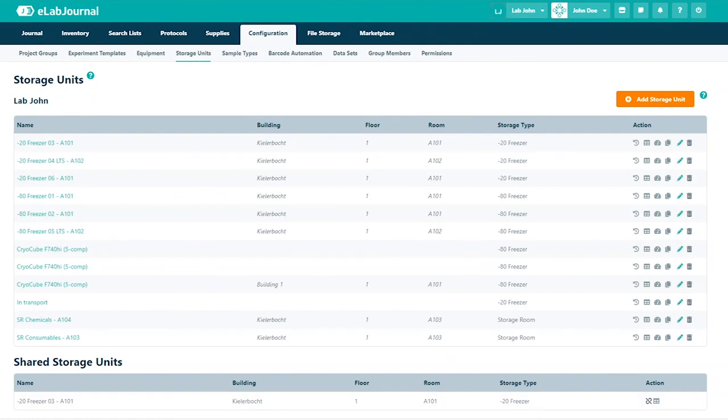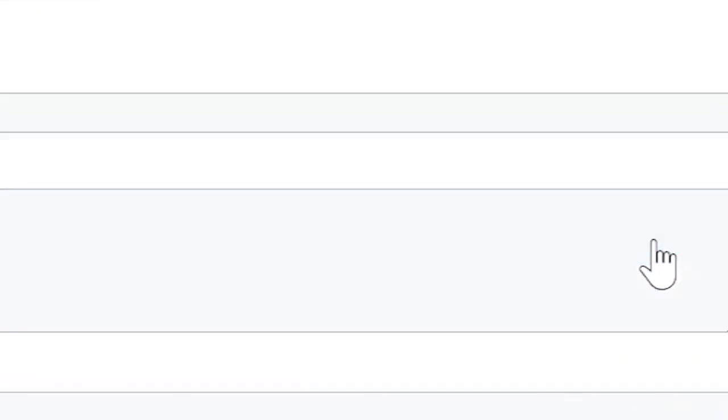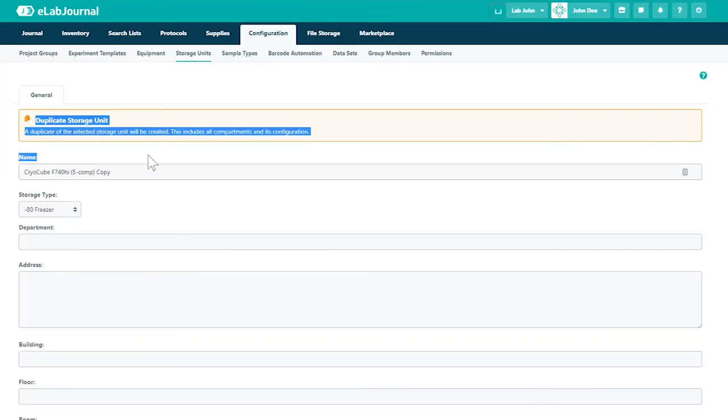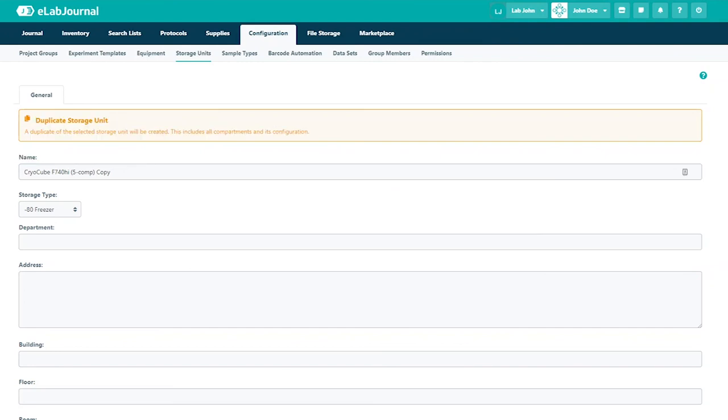You can also duplicate the storage units by clicking the corresponding button and inputting the necessary fields.